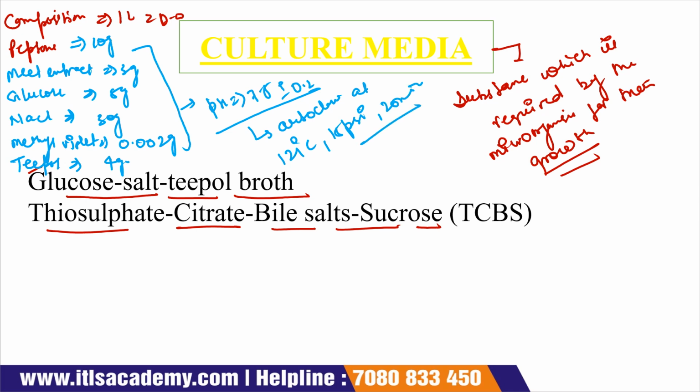The other media that we require is thiosulfate citrate bile salt sucrose, that is TCBS. Again, this composition is for 1 liter.